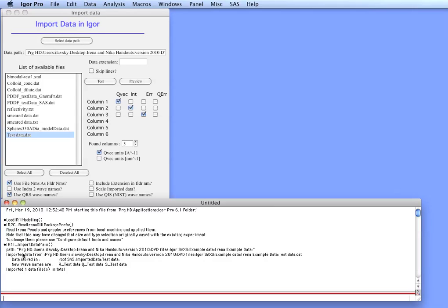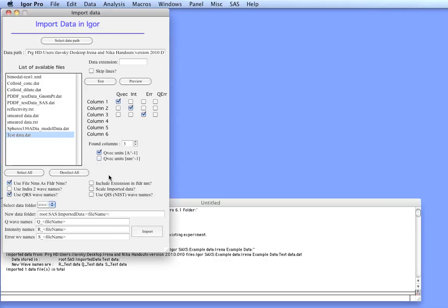As you can see, there is a record in the history area what was imported, where it was stored and what the names were. Now we have the data.